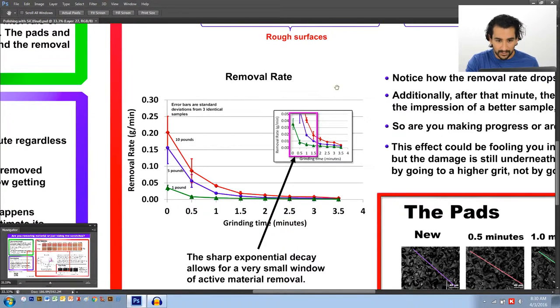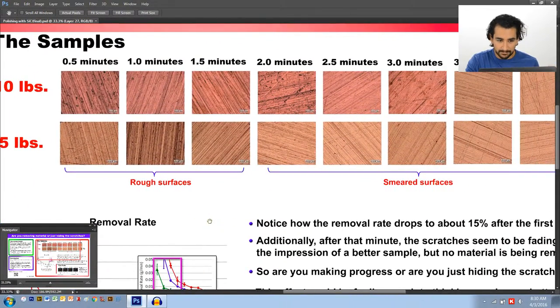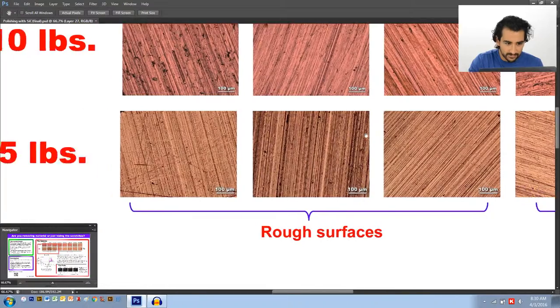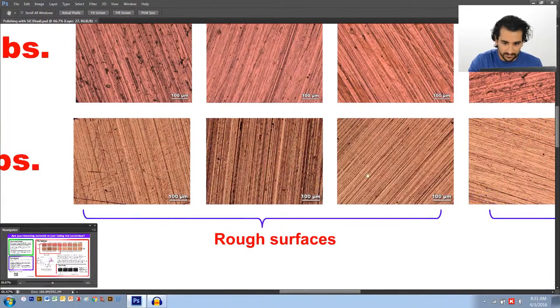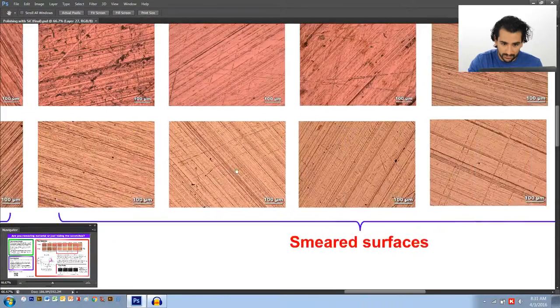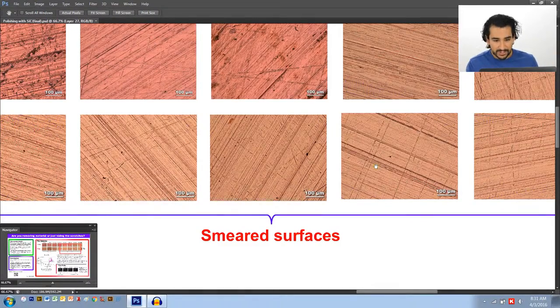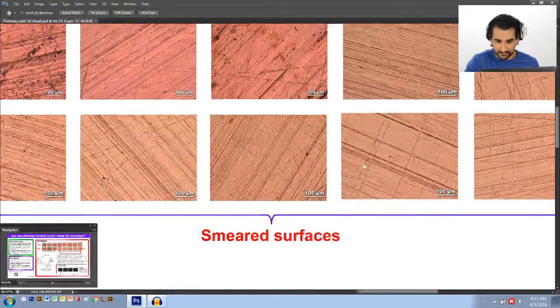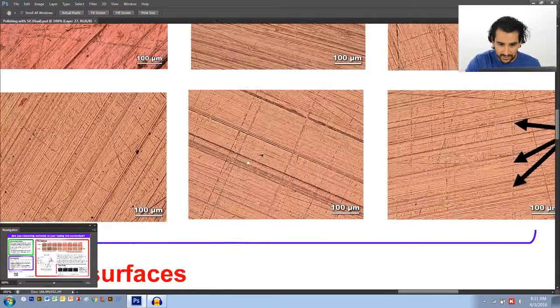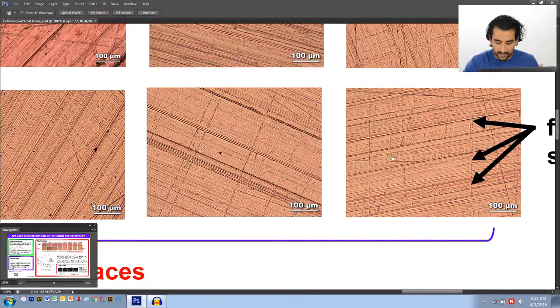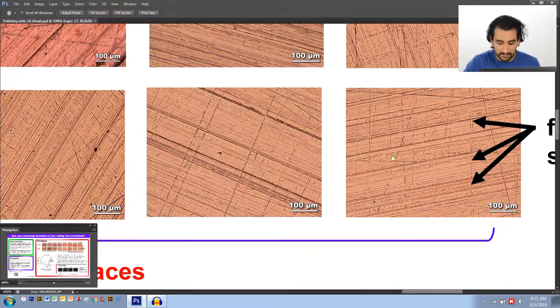Now, I did find something that may tempt people into using the pads for a little longer. If you look closely at these images here, you'll find that the first three, look at the five pound trays, for example. The first three images, the first one and a half minutes, are very rough looking. And then, if you keep using them for a little longer, they start looking a little prettier. They start looking a little better. And you might say, oh cool, well, my sample is looking great. But there's no material being removed here. And if you look closely, what's going on here is that the scratches are getting buried. The material is being smeared over itself because it's just being pushed against paper. And the scratches are being buried. And you have to ask yourself, is that a good thing? Well, I don't think so.